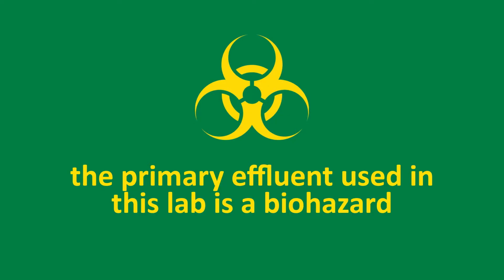Also, the primary effluent used in this lab is a biohazard. It can potentially contain pathogenic organisms. Any individuals who may be in contact with small children or those with suppressed immune systems should take extra precaution.